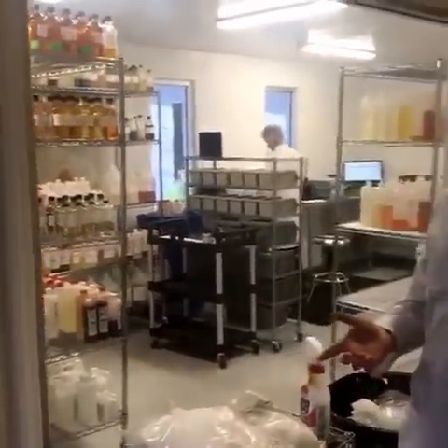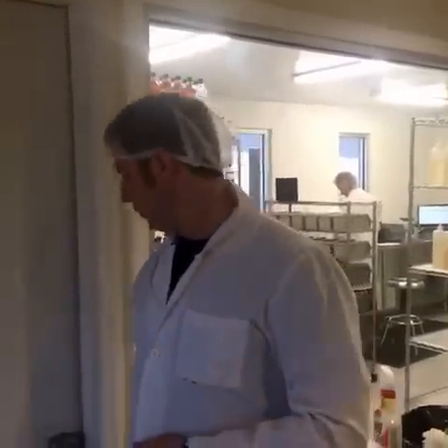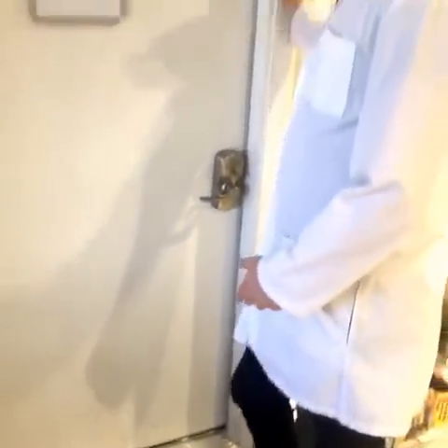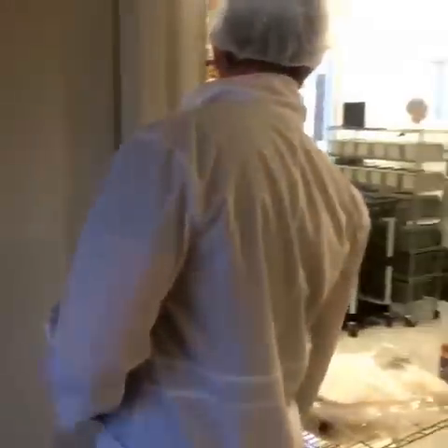All right. So when he's bringing in stuff, this is turned on, right? Correct. So we may as well do that right now. We got sticky things right here, just so we can get rid of any dust or anything that might be on people's shoes. Yep. So let's go on in. As you can see, it's positive pressure, so it's a little bit hard to open.